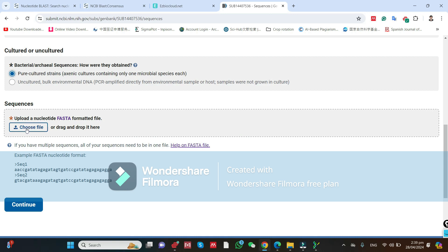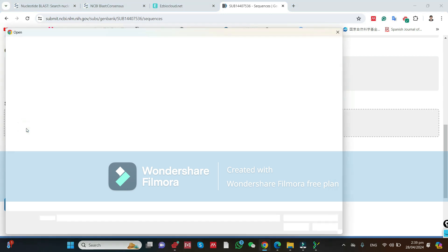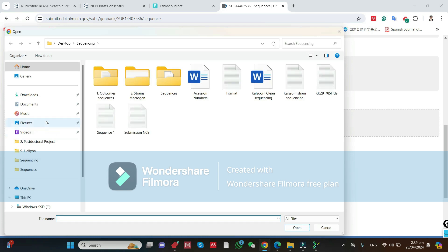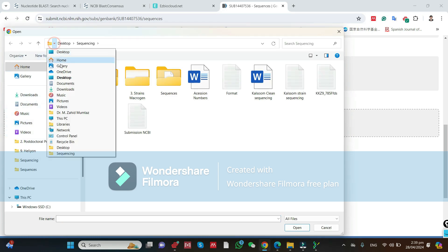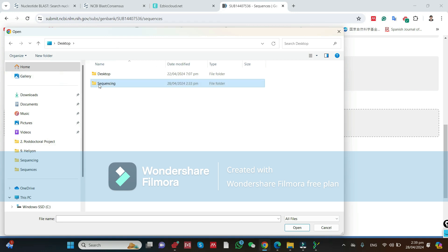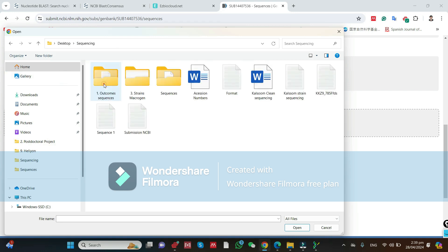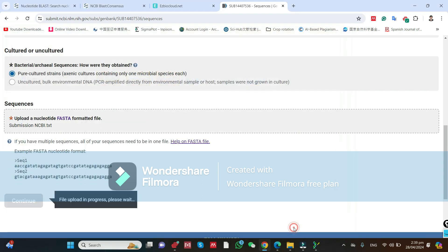Now select the desired file — this is a very important step. Click on Choose File. I have the file on the desktop. Here is the sequence, here is the submission NCBI FASTA file. I will select this one and click Open.